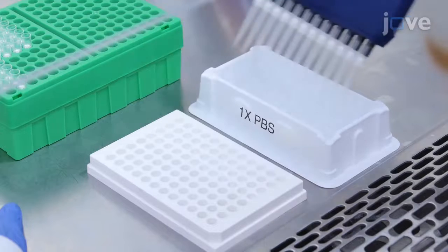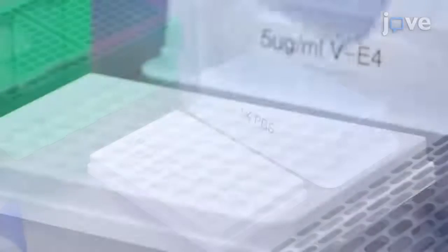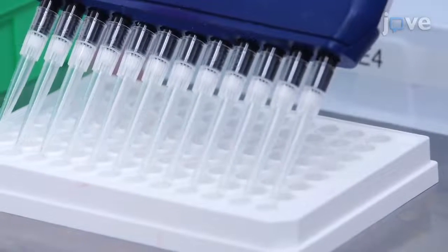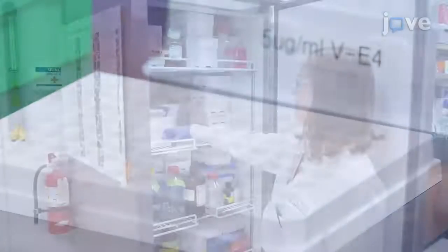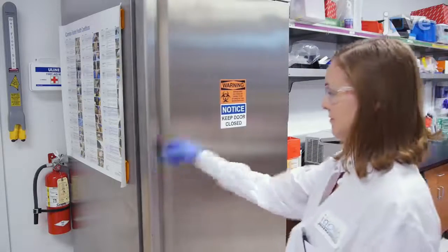To wash the plate, add 250 microliters of PBS to each well. After repeating the wash two more times, add 100 microliters of Capture Anti-Guinea Pig Interferon Gamma Antibody VE4 to each well. Then incubate the plate for at least 12 hours at 4 degrees Celsius.